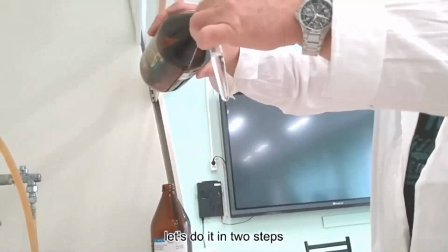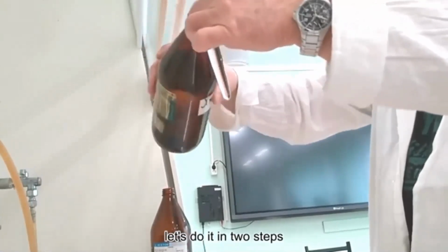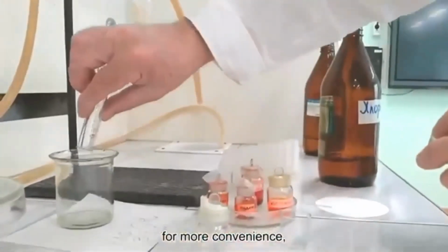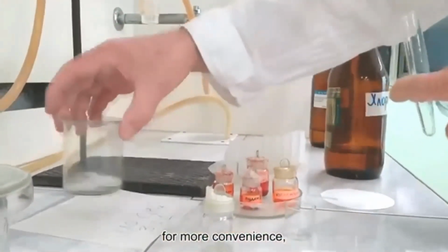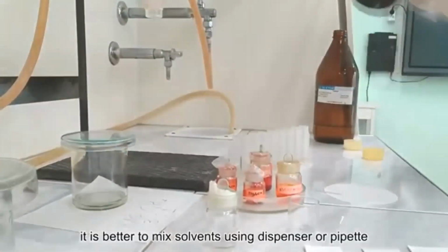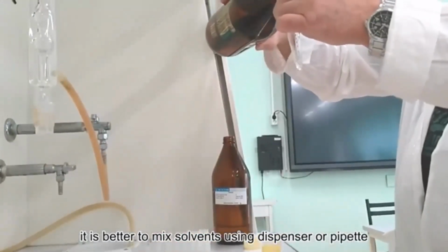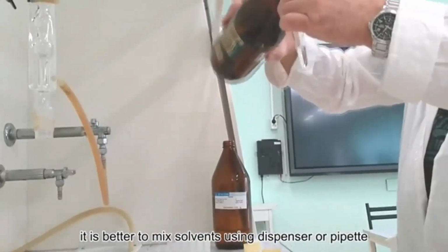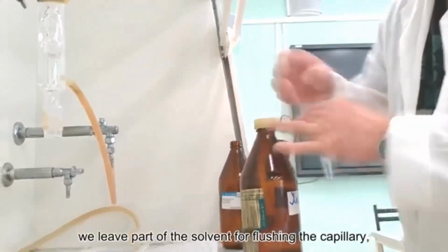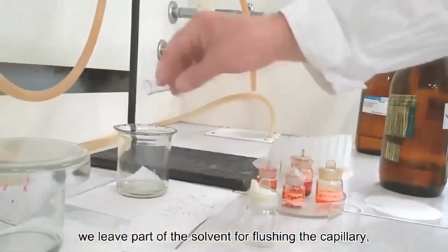Теперь хлороформ. Это из бутылок больших, конечно. Ну, очень удачно все делается. Сейчас. Еще туда надо чуть-чуть добавить хлороформа. Чуть-чуть. Миллилитр. Потому что там уже вот так. Еще надо будет его в промывку добавить. Или можем прямо отсюда слить в промывку.